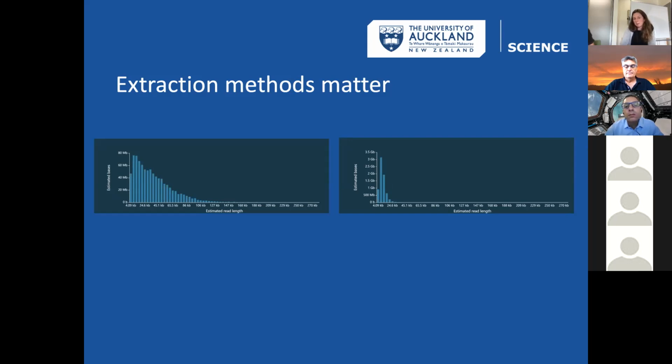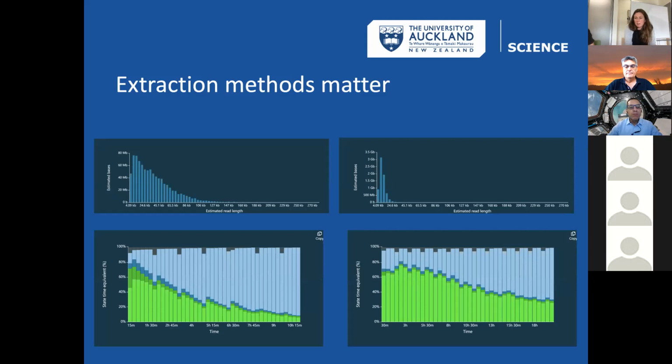The same tissue extracted with a spin column, which is not optimal for this kind of tissue, becomes quite degraded. We've got a read N50 of about 7 kb from the exact same starting material. Swings and roundabouts though, because this long extraction actually blocks the pores a lot more. So we struggle to get really good yield out from these long molecules, whereas these fragmented smaller molecules actually are less problematic for the sequencing. So this project will end up with a mixture of these 2 types of libraries, and actually that should come together to produce a very nice quality assembly.